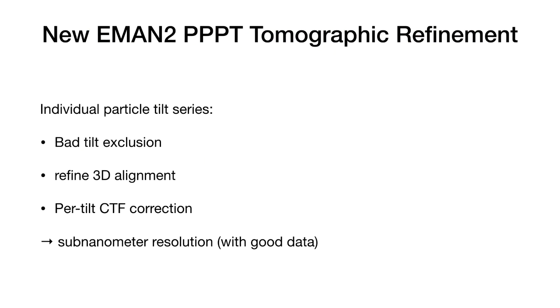Each of the images in that per particle tilt series can then be handled somewhat independently from one another, but also still somewhat associated with one another. So you have basically an initial geometry for how the alignments should be, but you may need to fine-tune the individual tilt alignments by a few pixels because of the poor relationship between the overall alignment of the tomogram and the local alignment.